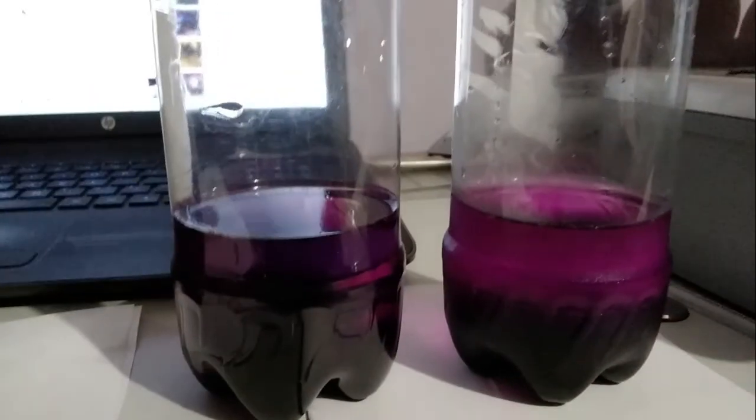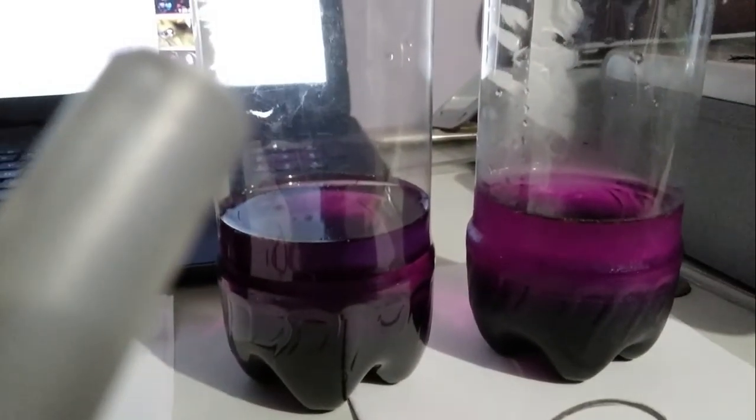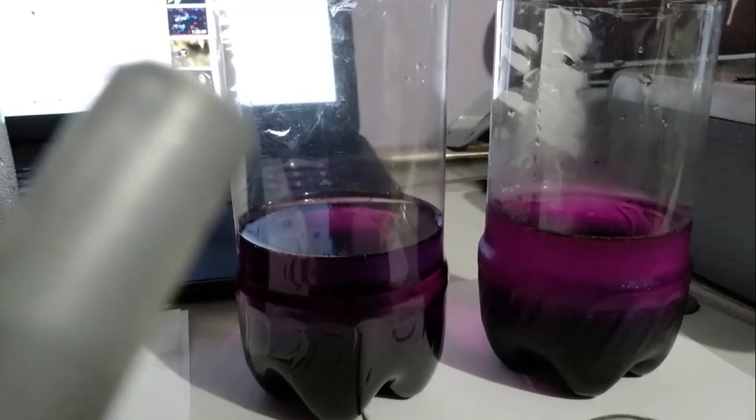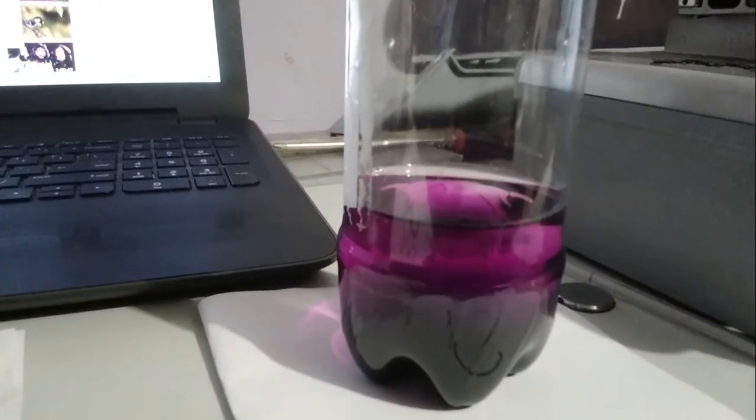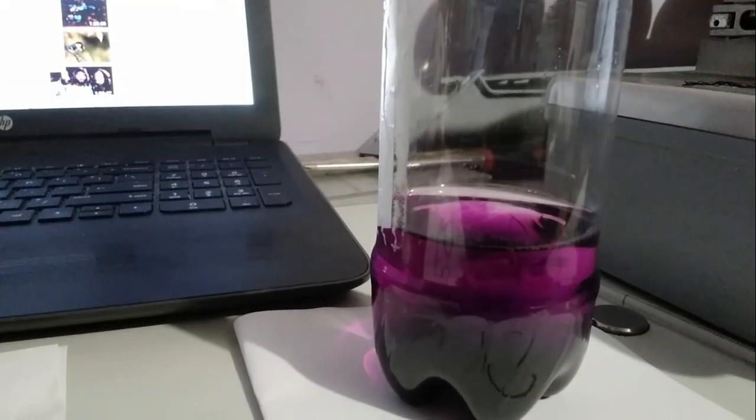Just let me switch them around and see if that would be the same thing. Oh, so there's a lighting concern. So if you look over here, you have specimen A. Look at what's happening there. Look at it. Look to the bottom. Probably we'll have to get a ruler and probably measure the height. Let's move this out, and we're going to be looking at this. All right. So I'm going to be pausing the camera for now, and then we are going to come back and see if we can measure the height.